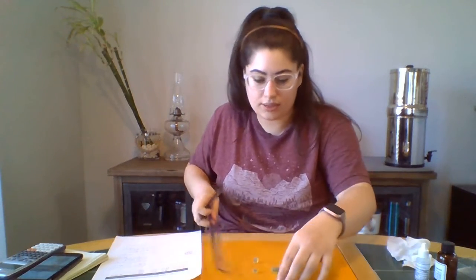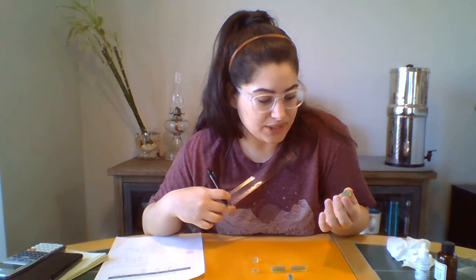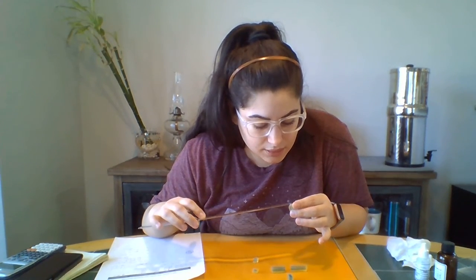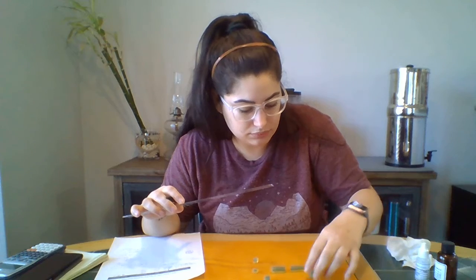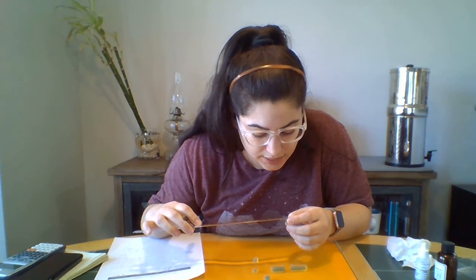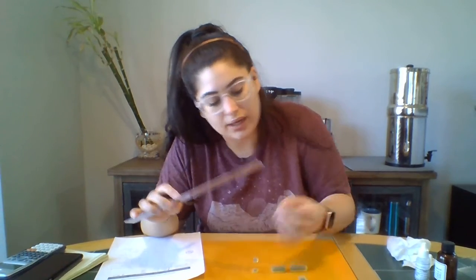And then this one. I was going to say which edge do we measure, but I guess it doesn't matter. It goes in the same all the way around. So let me measure this one too. Whoop. This one is almost the same. It's just a little bit more, honestly. 0.3. It's right at the third notch.